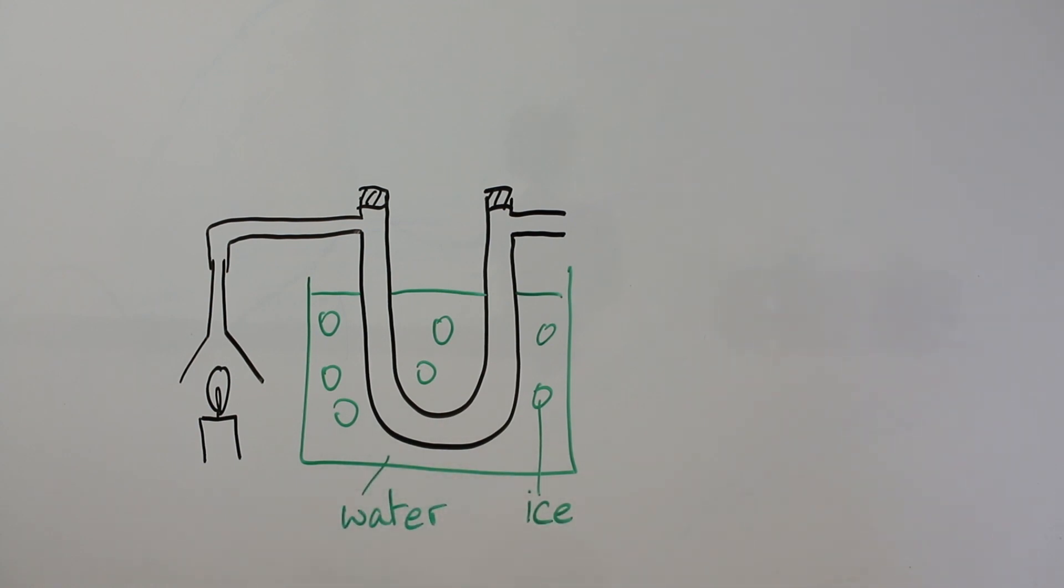That's going to make this really quite cold and in here we're going to place a piece of cobalt chloride paper. The cobalt chloride paper initially is blue and if any water condenses onto it then it will turn pink.